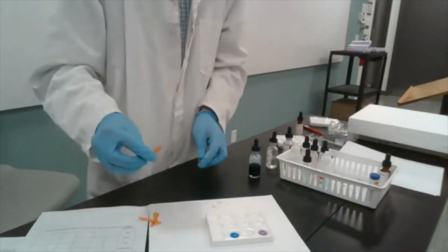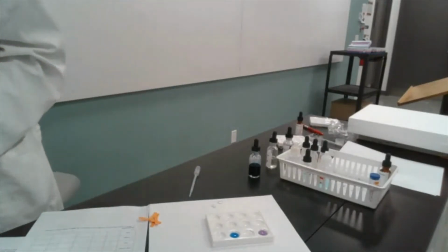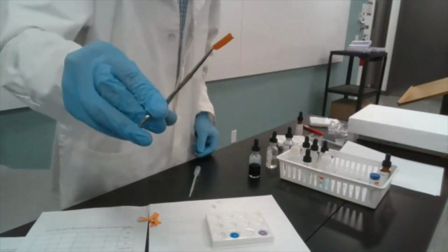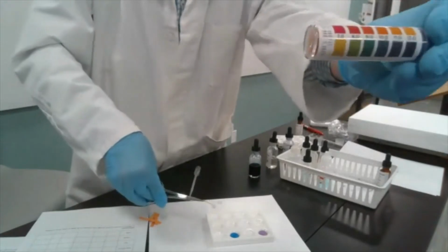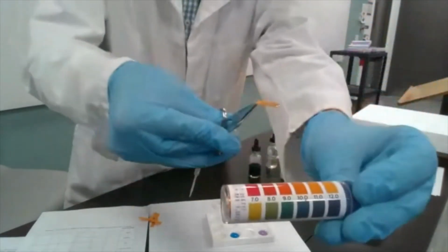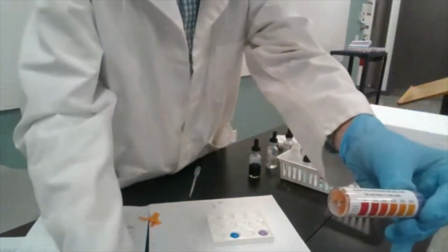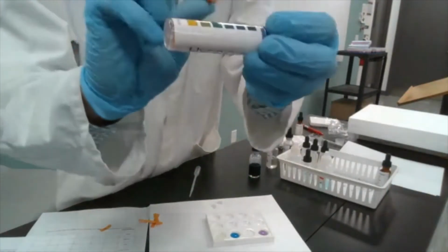Now I'm going to apply a little bit of water to this strip of indicator paper. Let me just grab my tweezer. I'm going to dip this strip of paper into the water, and then we're going to look closely at the resulting color and see what the best match is. Oops. There color-wise, and I think that's due to the camera.